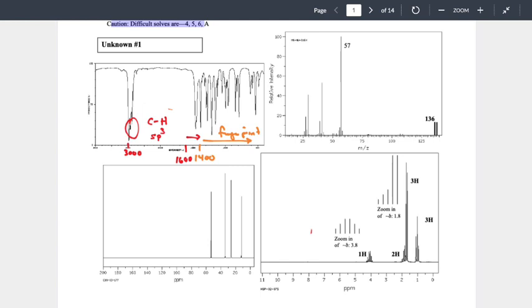I would argue that it should go onto the worksheet or our spect.org and away from the spectra, because if we put all our work on the spectra, there's a bunch of stuff there that we aren't using. We don't need to see all those peaks. What we need to see is the important thing, that it's CH sp3. That's all I care about. The rest of it is noise that could confuse me later on. So I want to shift away from that space. Kind of make sense?